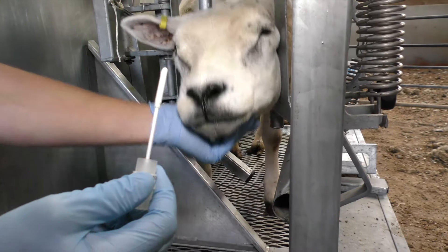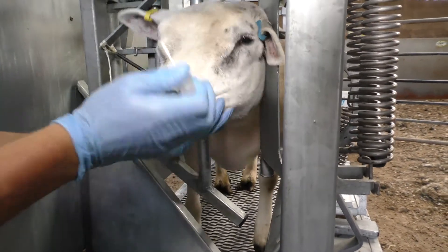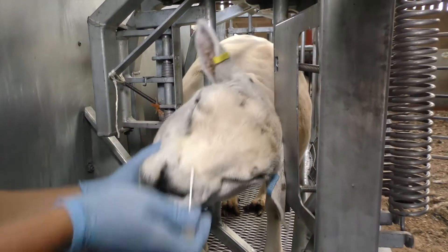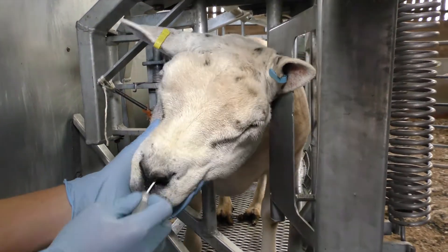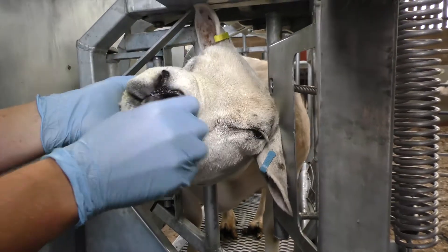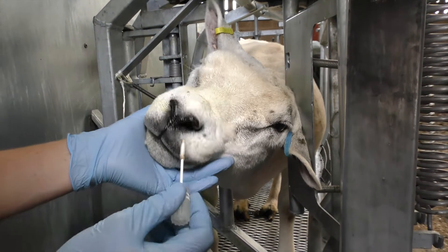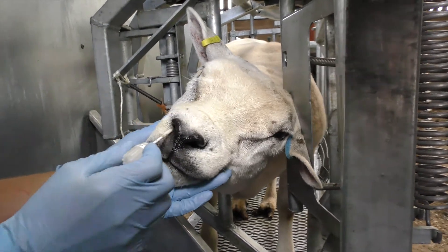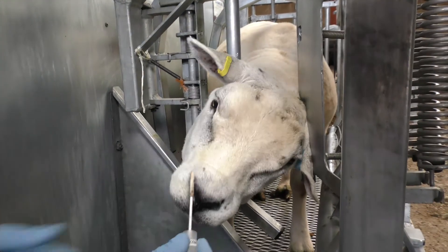So whilst the animal is restrained, put the swab into the animal's nose and ensure sufficient contact is made between the swab and the side of the animal's nose for at least five seconds. Like that.